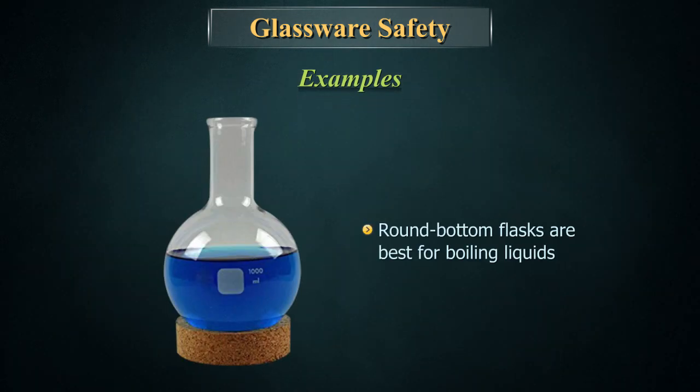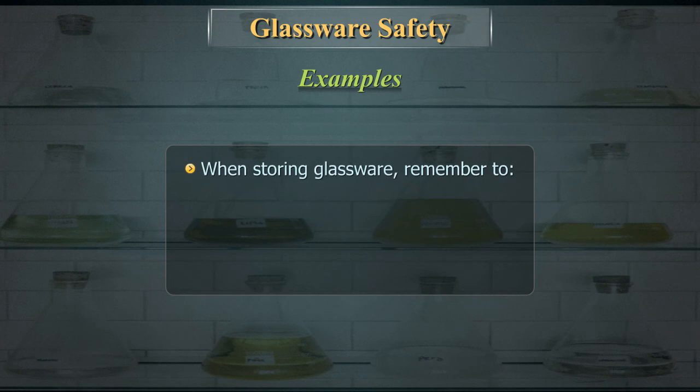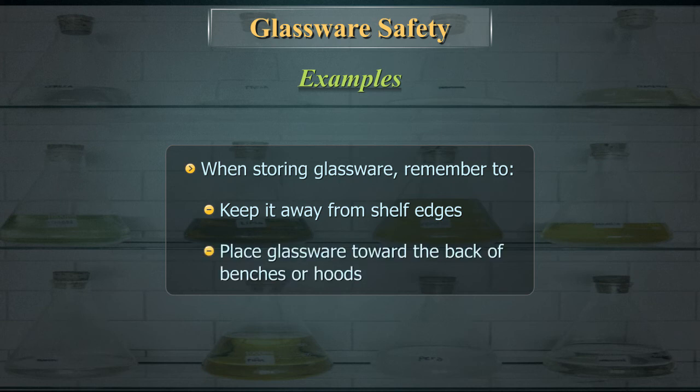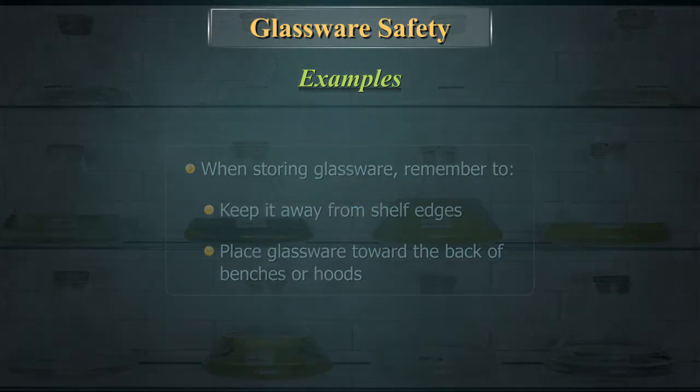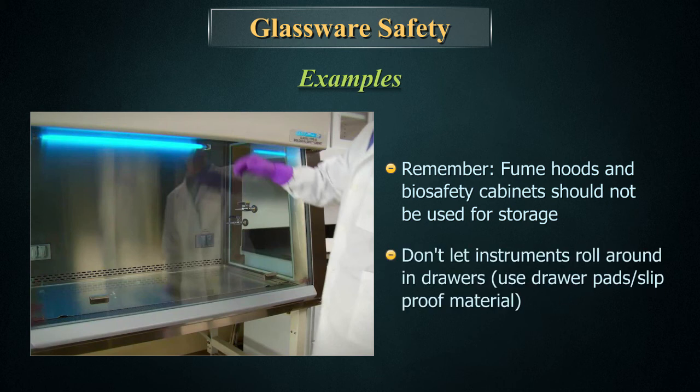Round bottom flasks are best for boiling liquids. Never set hot glass on a cold bench top. When storing glassware, keep it away from shelf edges. Place glassware toward the back of benches or fume hoods. Remember, fume hoods and biosafety cabinets should not be used for storage. Don't let instruments roll around in drawers — use drawer pads or slip-proof material.